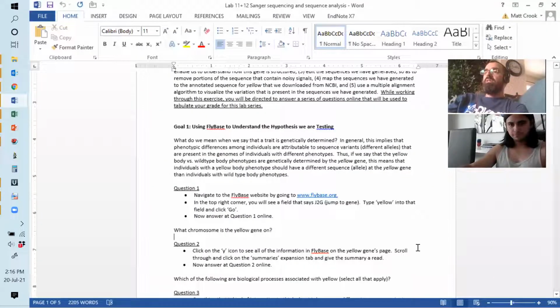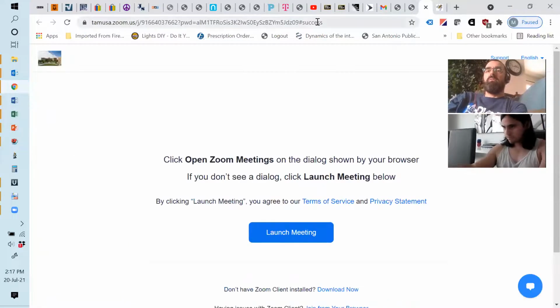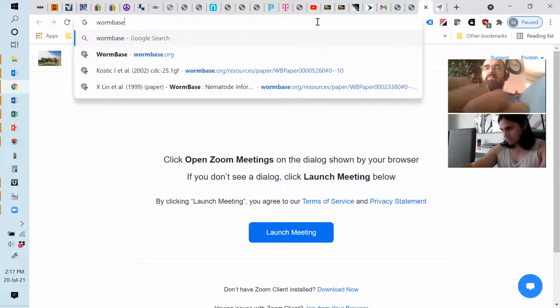All right, so the very first step in any process is really to get at what information is already available, right? You don't have to reinvent the wheel here. Essentially you stand on the shoulders of others, right? So this is all stuff that other people have discovered, and this is all placed into a repository for you to access. And so if you work on flies, which I don't, you would go to Flybase. Actually, I'll show you where I go. This is where I hang out.